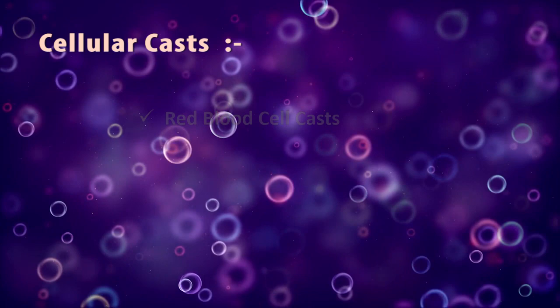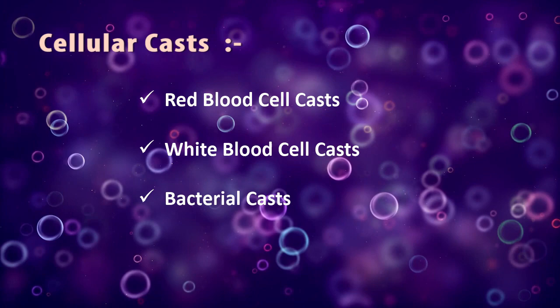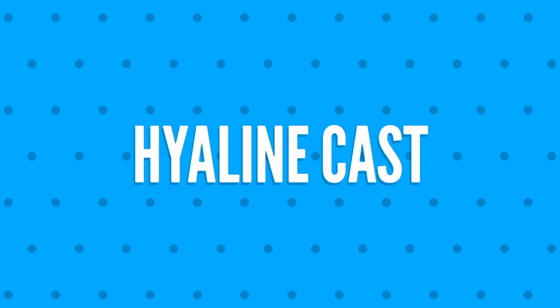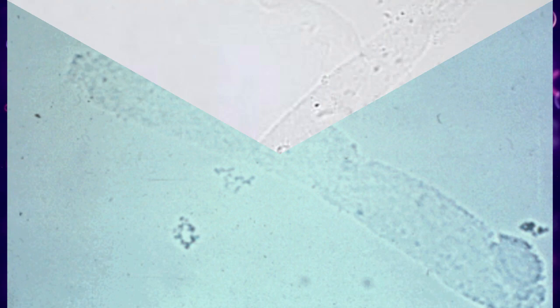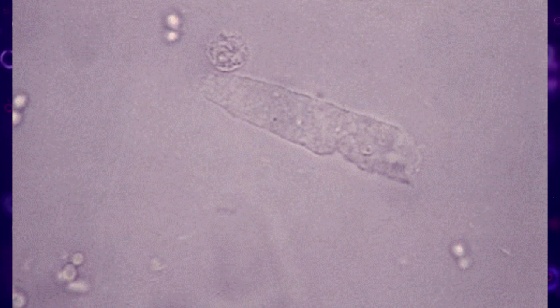Hyaline casts are the most common type of casts, composed of solidified Tamm-Horsfall mucoprotein. They have a smooth texture and a refractive index very close to that of the surrounding fluid, with parallel sides, clear margins, and blunted ends.